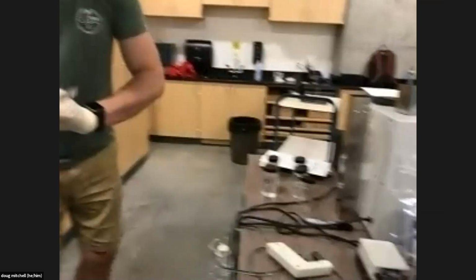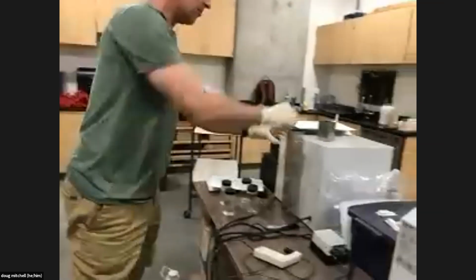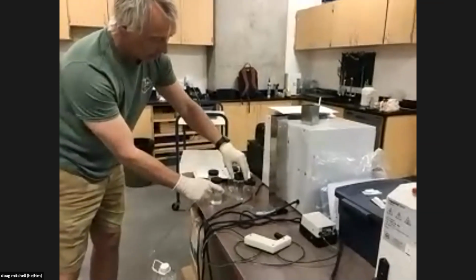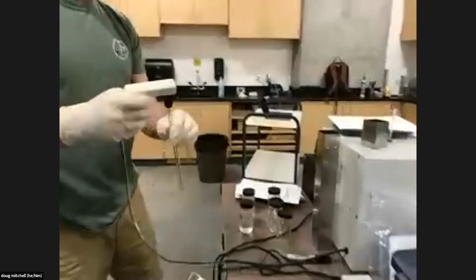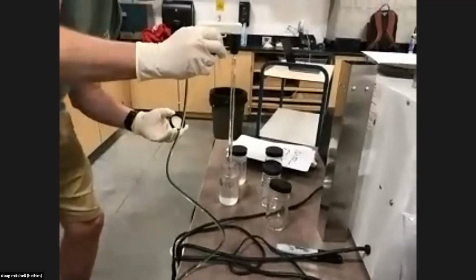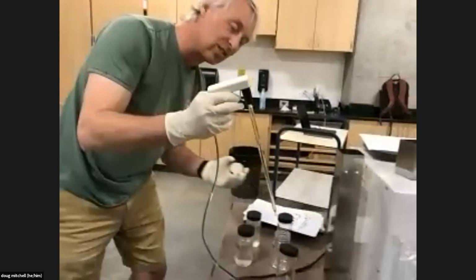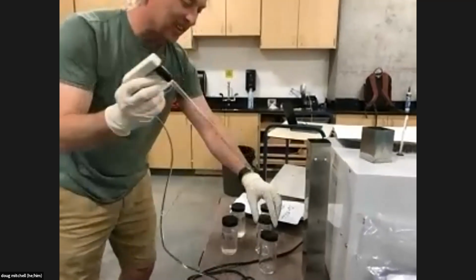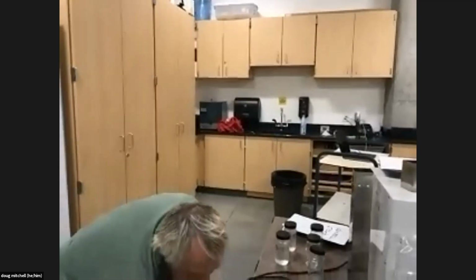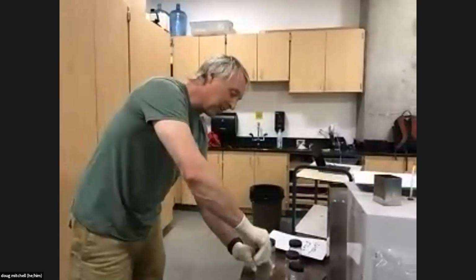And I take the used pipettes along with used containers and put them on a tray to put in the autoclave when we're all done. So this second one is for the McGower outfall. These are notoriously dirty sites, especially during tourist season. So that's just starting. And every year it seems like Cannon Beach says, oh, we fixed these sewers that were leaking. And they never seem to quite fix it, but hopefully they will this year.